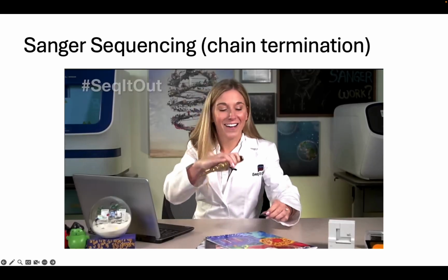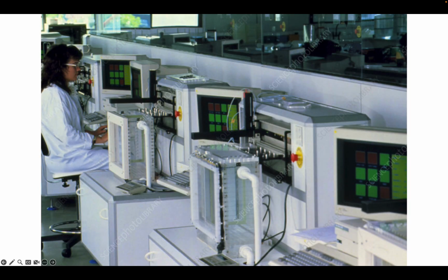Oh, hey. So that type of sequencing analysis is how scientists started doing the first genome sequencing. And again, the first organism that was actually sequenced, like the first cellular organism, was a bacterium. And they had tons of these machines that would run the sequences all at one time.